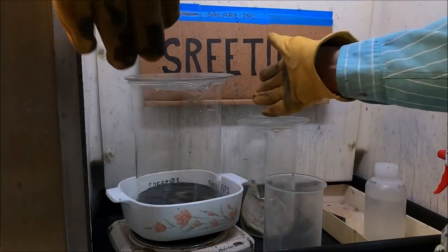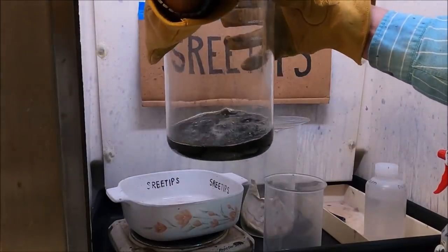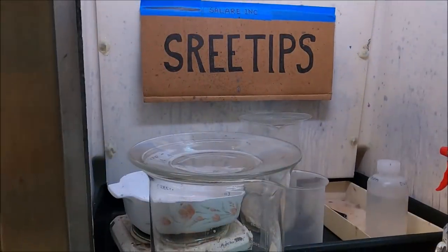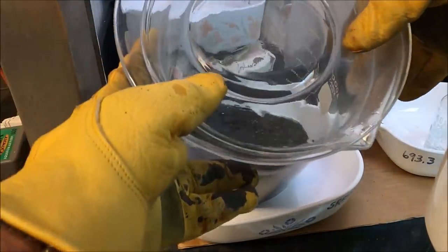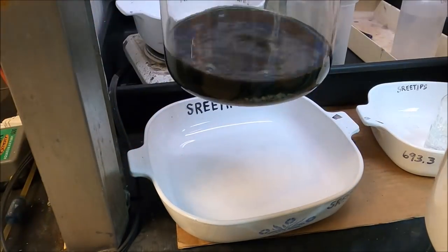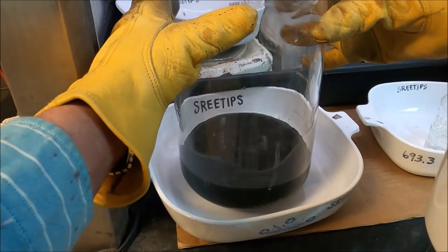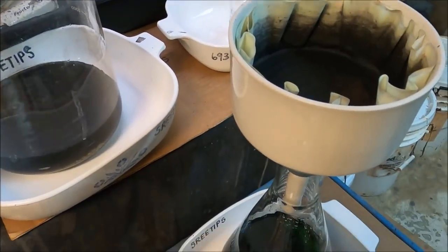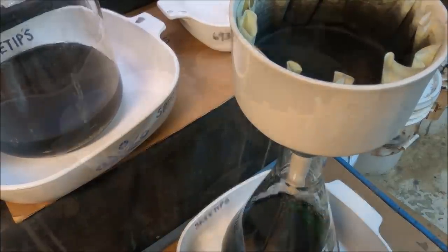Solution has been boiling now for a couple hours. I've been adding nitric acid to it, and I think I've pretty much got most of the solids to go into solution here, or most of the silver to go into solution. I got a little bit left down there in the bottom. What we're going to do now is let this cool off, and then we're going to pour it through this same filter and add it to this solution here.